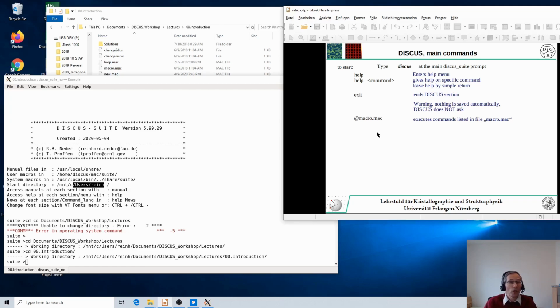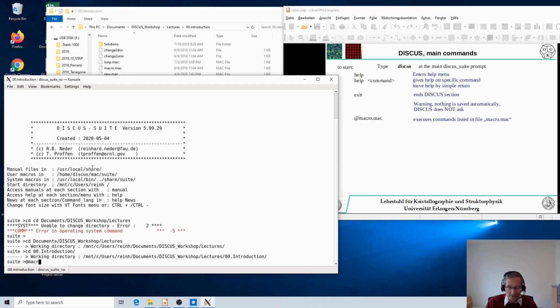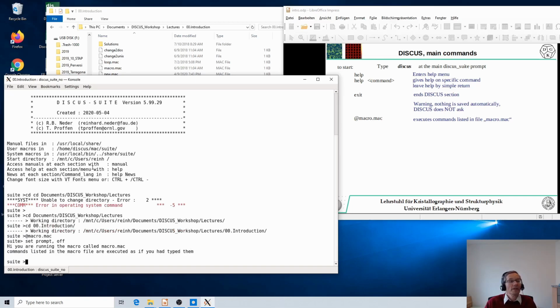And the next thing that one often uses, rather than to type these commands interactively, so 99.59 or so % of the time, I will actually not type the commands interactively, but I will type these commands into a small, simple text file, a macro we call it, and this macro file contains the commands as if you had typed them manually, and with the @ sign in front of it, that will instruct the thing to do. Here's a small macro that I built earlier called macro.mac. So what I can do is, if I type the @ command and then macro.mac, again with the tabulator keys that can be expanded to a full name, now this will run the actual commands as if printed in the command.